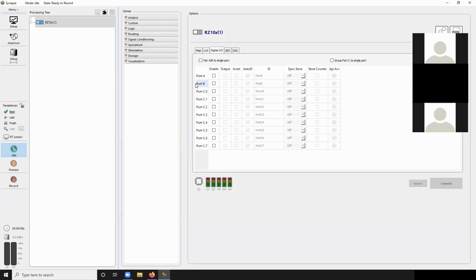Going to this digital I/O, this is important in photometry for a lot of people. This digital I/O is going to be your input-output for external devices that send TTL communications, behavioral codes. Very common is maybe Med Associates, Harvard Apparatus, Lafayette, something like that, where you hook up maybe a DB25 cable to the front DB25 port of the RZ10X. You'll see there's a DB25 connector and it says digital I/O. There's also 4 BNCs labeled 0, 1, 2, and 3. So the DB25 connector talks to all 24 of these bits.